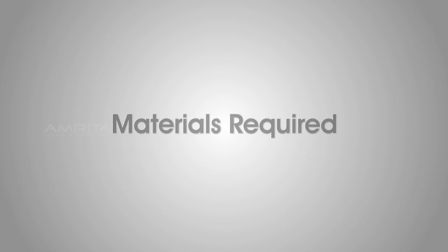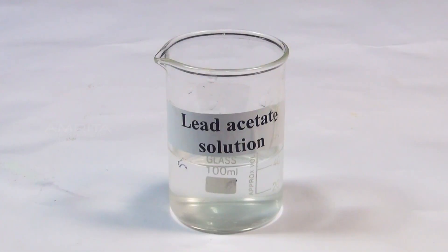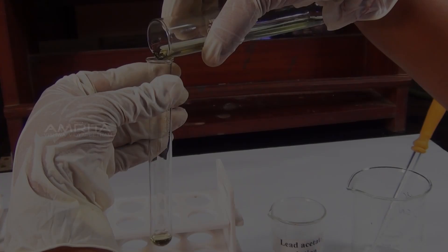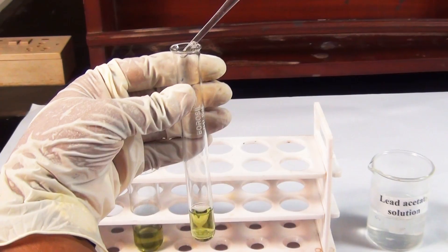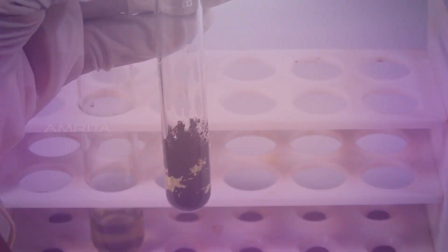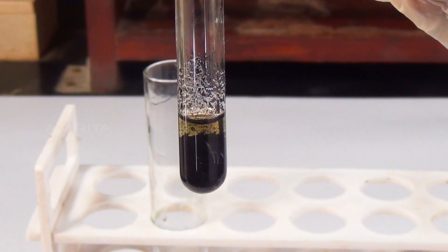Lead acetate test. Materials required: aqueous solution of the salt, lead acetate solution, test tube, and a dropper. Procedure: Take a small portion of aqueous solution of the salt in the test tube and add a small amount of lead acetate solution using a dropper. Sulphide reacts with lead acetate to form a black precipitate of lead sulphide.